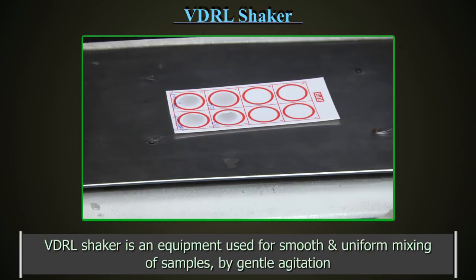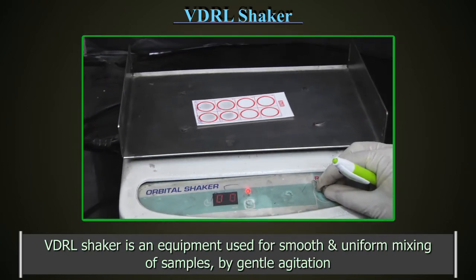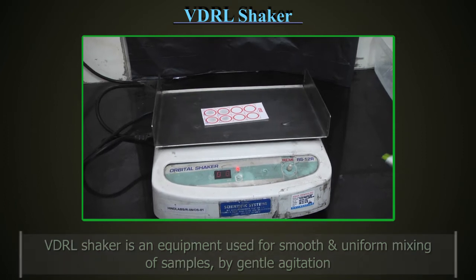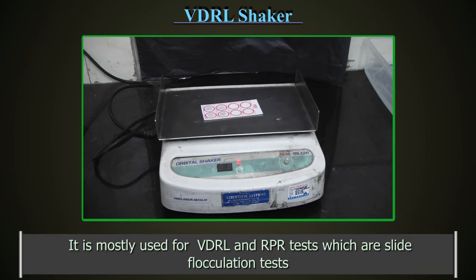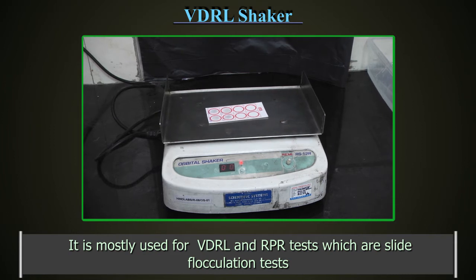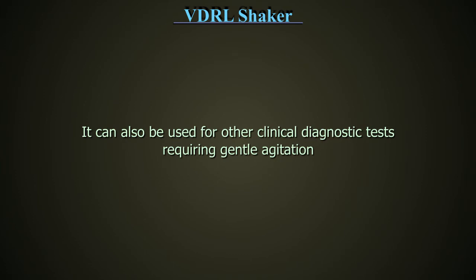VDRL Shaker is an equipment used for smooth and uniform mixing of samples by gentle agitation. It helps to standardize the process of testing. It is mostly used for VDRL and RPR tests, which are slide flocculation tests. It can also be used for other clinical diagnostic tests requiring gentle agitation.